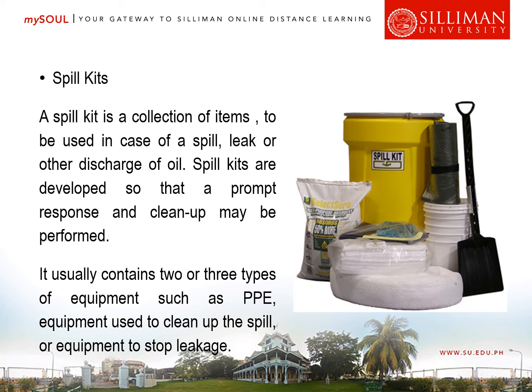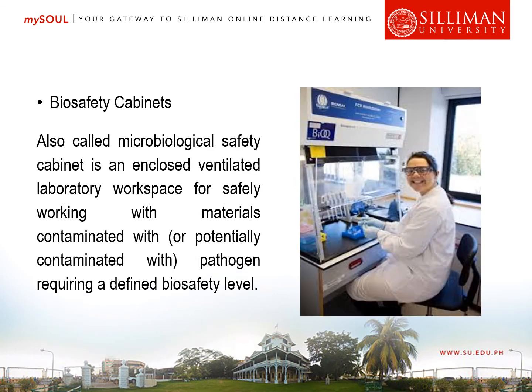It usually contains 2 or 3 types of equipment, such as personal protective equipment, equipment used to clean up the spill, or equipment to stop leakage. Then we have our biosafety cabinets. Guys, our biosafety cabinets are different from the chemical fume hood.